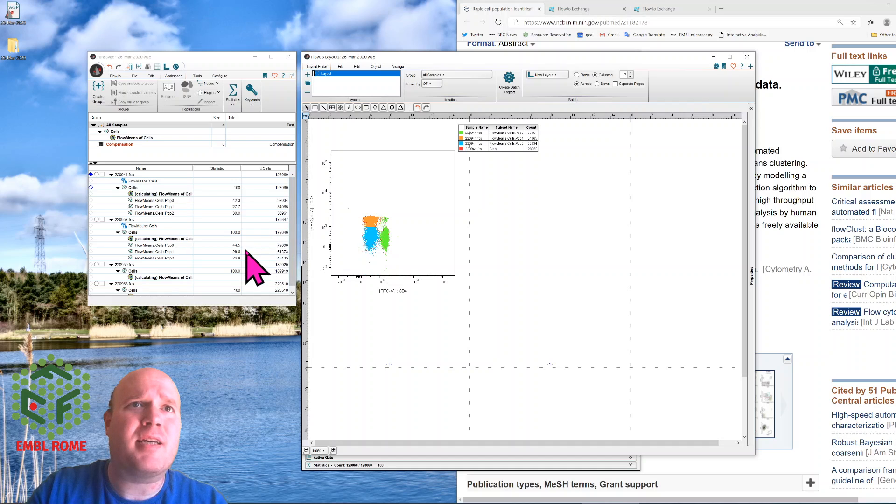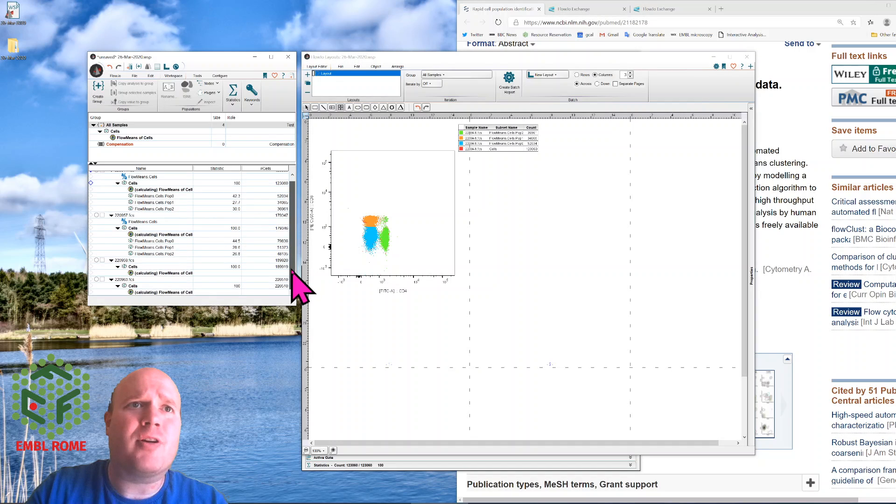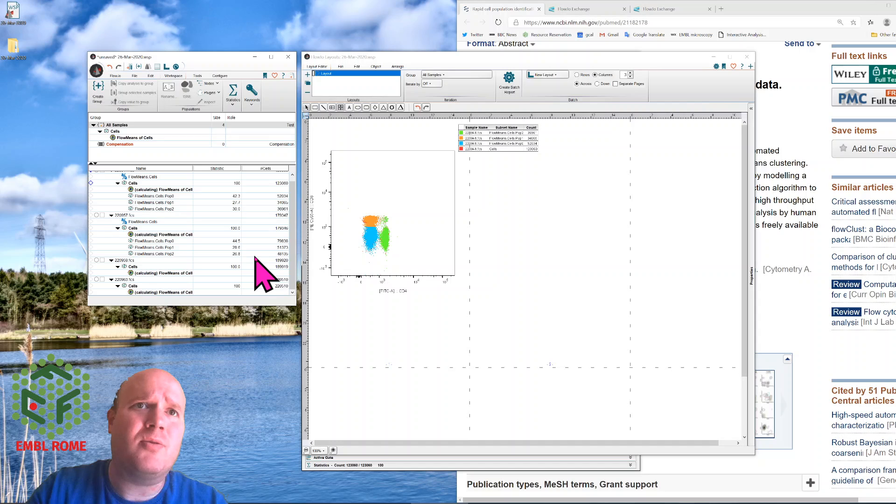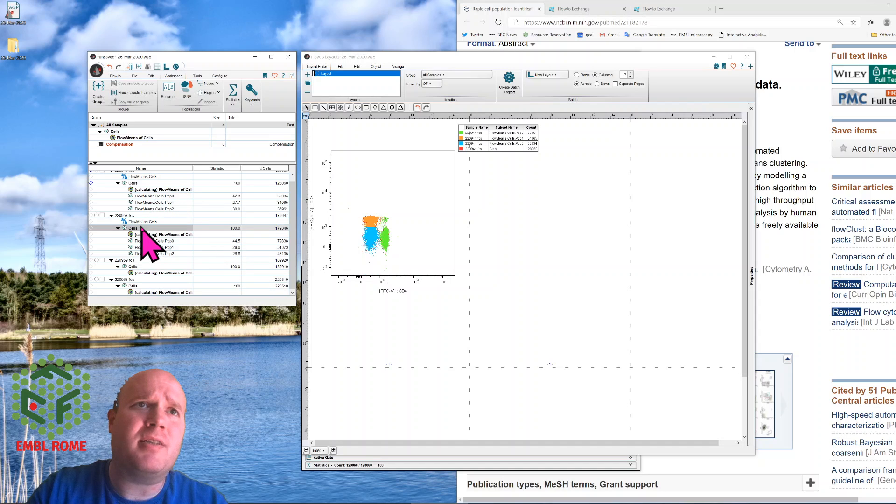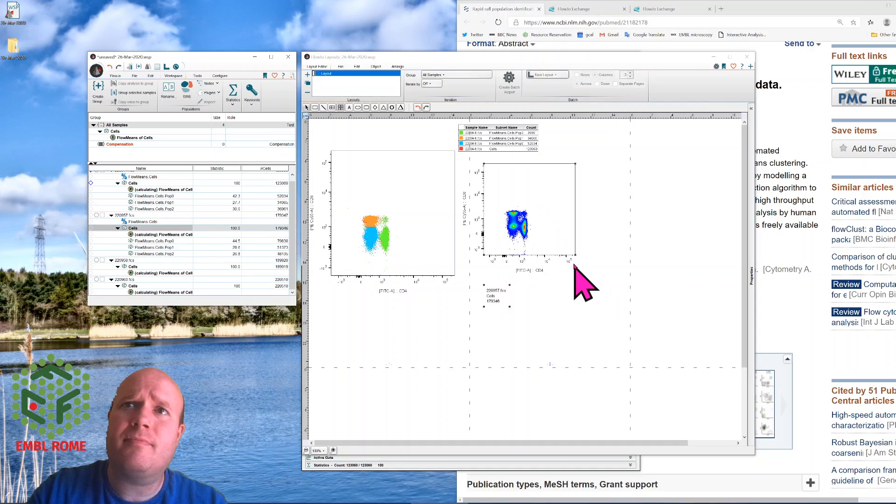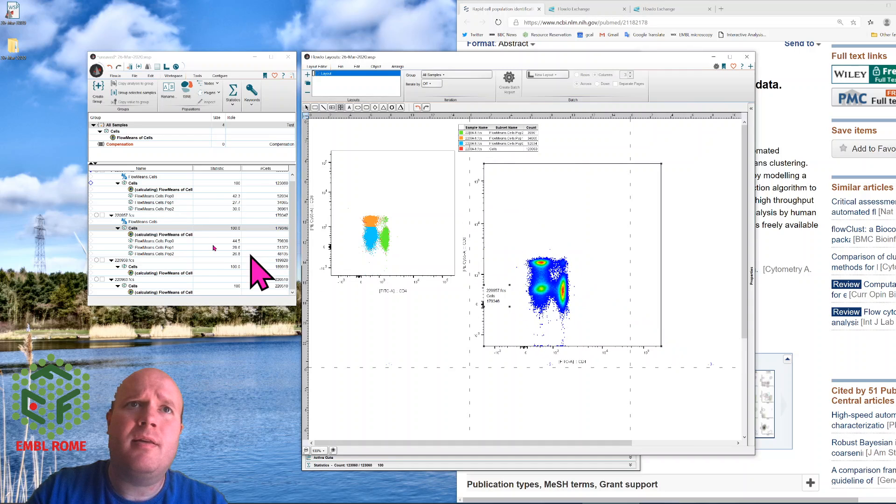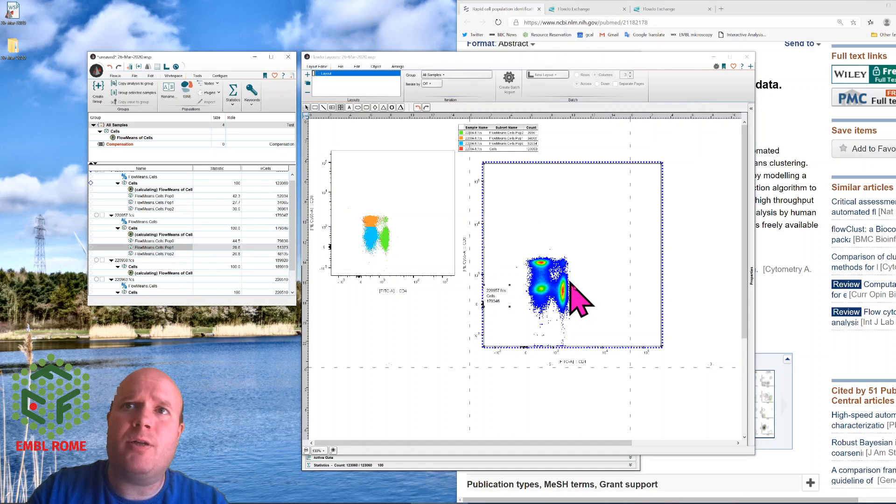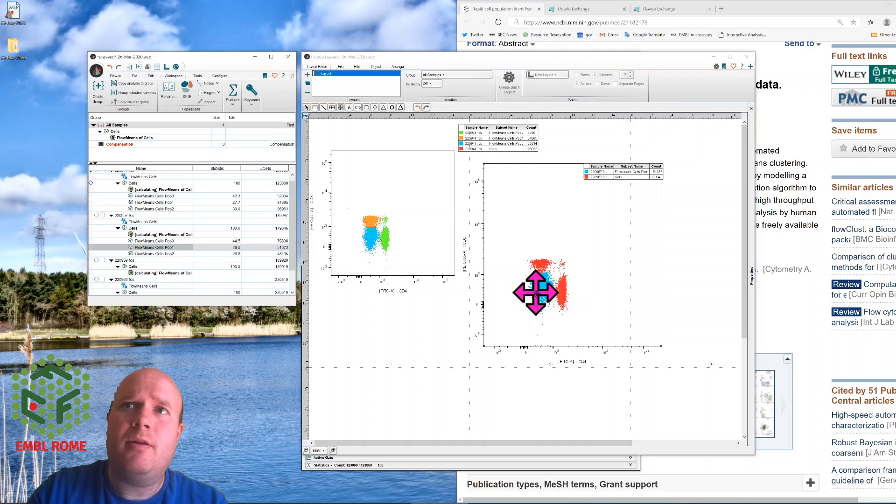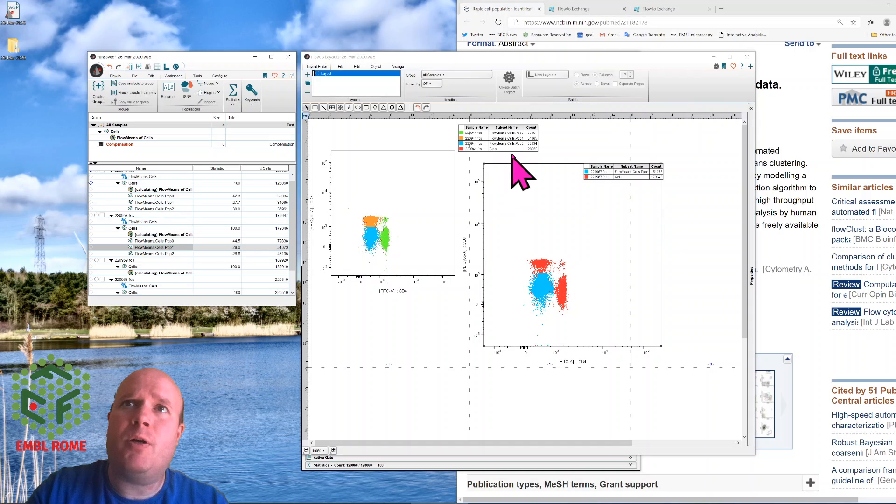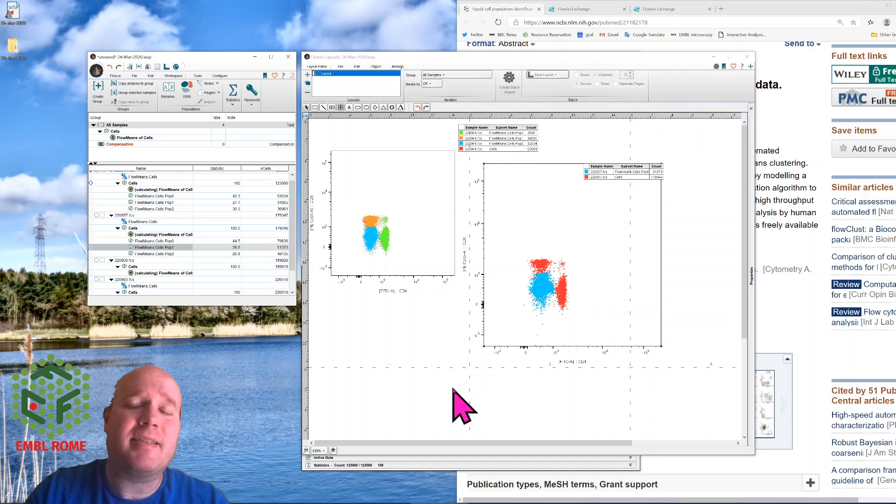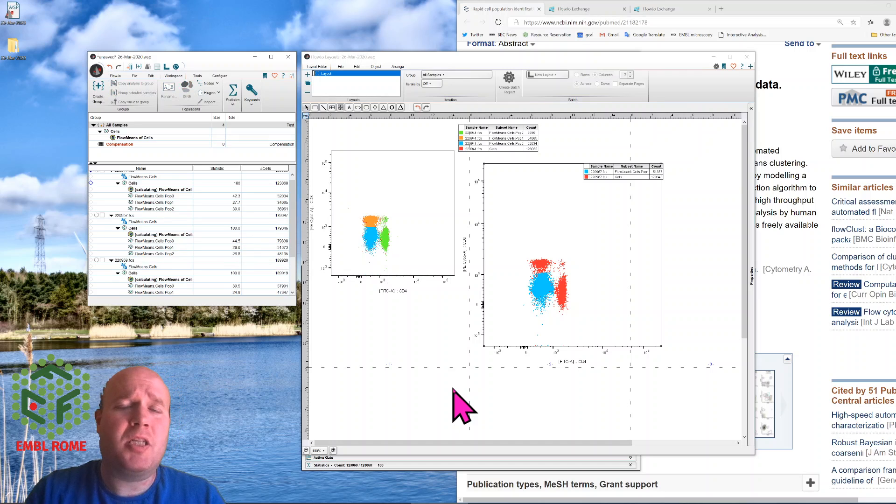For example, I were to drag across one of the other ones after it's finished loading, this one might work. So if I bring across cells from the second one, and then say, bring across population one. Population one here is the double negative, but population one up here is the orange, which is the CD8. So it's not ideal in that respect either.